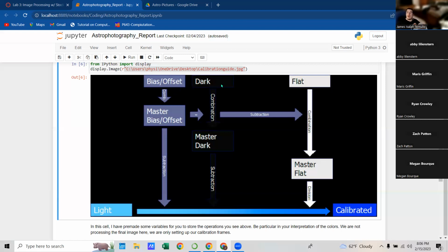So if we're thinking about how this actually works when we're taking images, a photon comes in from some source and hits an atom of the CCD chip, which I believe is silicon. There are different layers and it's a whole other field of physics, but let's just keep it at silicon. This photon gives that electron enough energy to kick it from the atom.